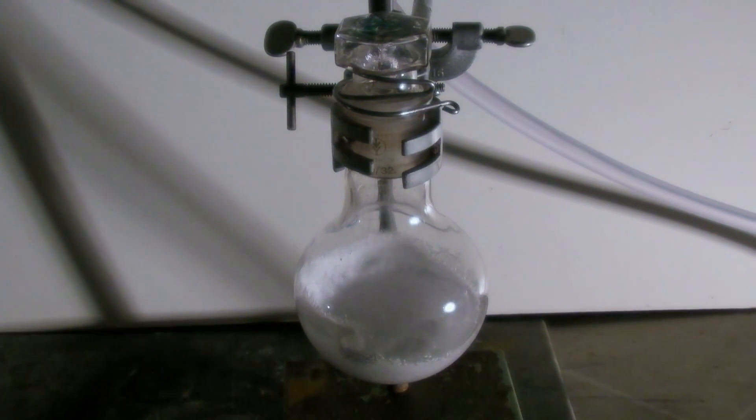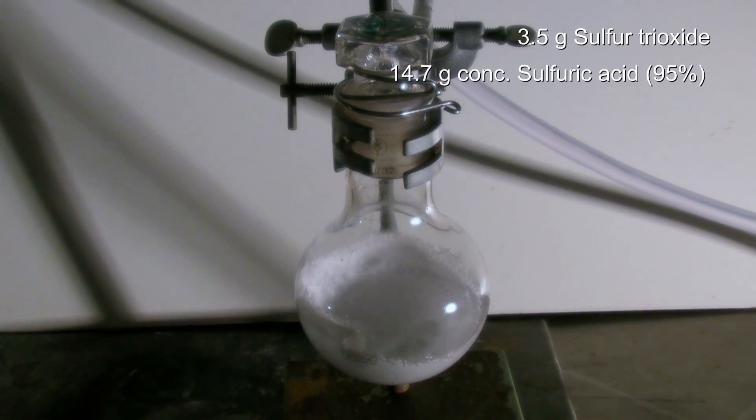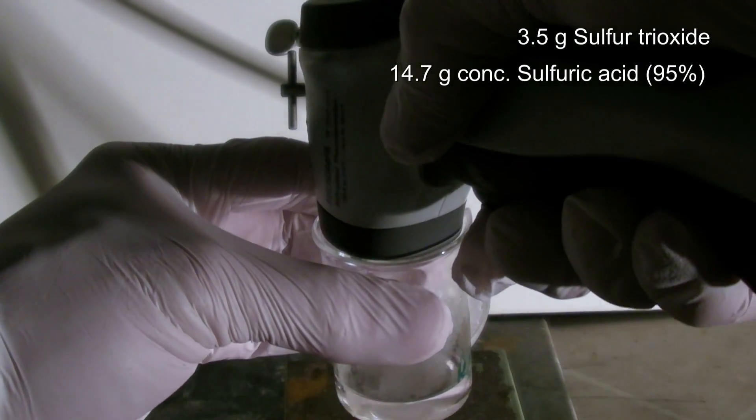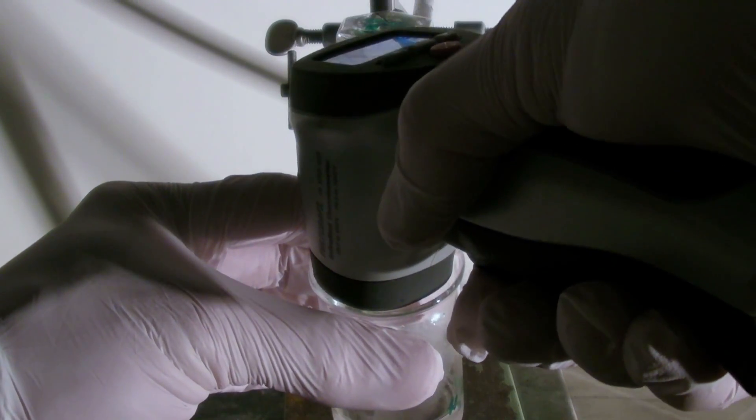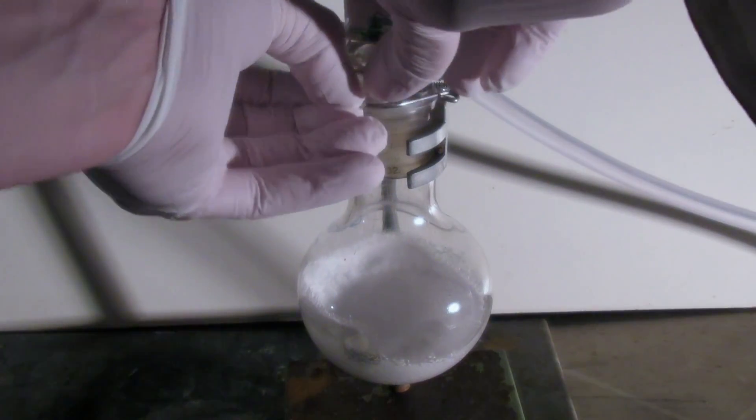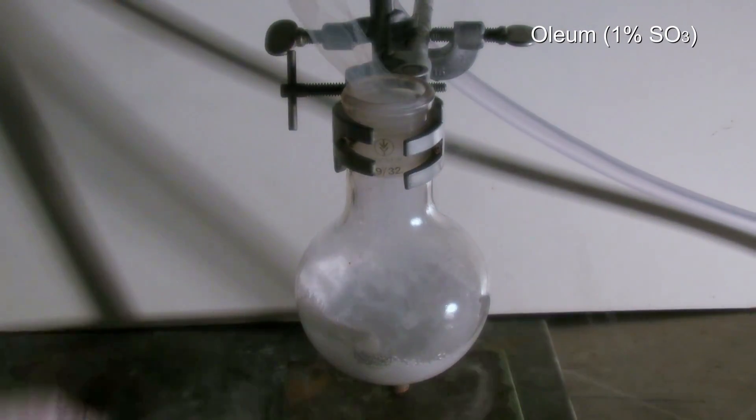For the experiment I wanted to prepare a 20% solution of sulfur trioxide (SO3) in sulfuric acid, which is also called oleum. 3.5 grams of sulfur trioxide were available, to which 14.7 grams of concentrated 95% sulfuric acid that had been previously cooled to 0 degrees C were added. Due to an underestimation of the influence of the water content in the acid, a mistake was made in the calculation, so the oleum that was prepared only has a concentration of 1% sulfur trioxide, which was obviously still enough for the experiment.